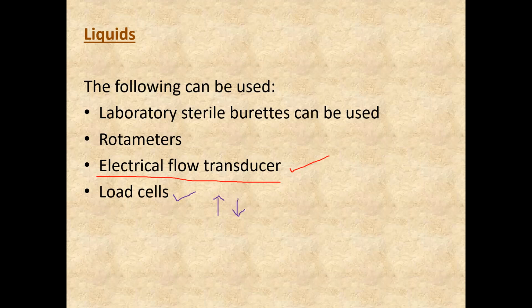Okay, so this is another technique which may be used with particulate matter or suspensions. Is there any other method which can be used to monitor the flow rate of liquids? Yes. Another indirect method of measuring flow rates of liquid aseptically is to use a metering pump which pumps liquid continuously at a predetermined and accurate rate and will determine the flow rate of the liquids. A variety of metering pumps are commercially available, including motorized syringes, peristaltic pumps, piston pumps, and diaphragm pumps.